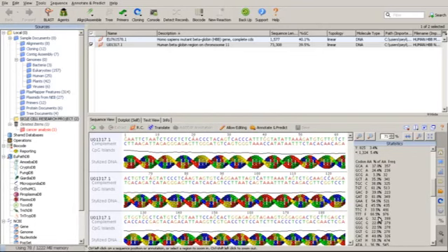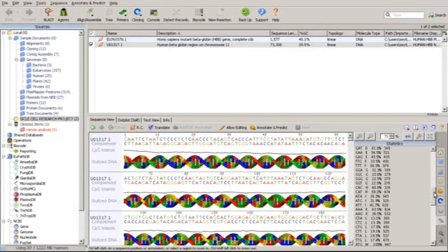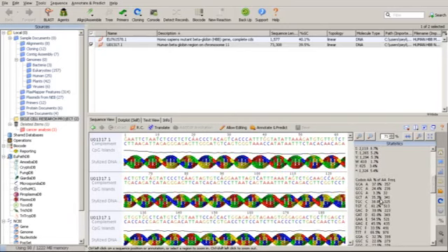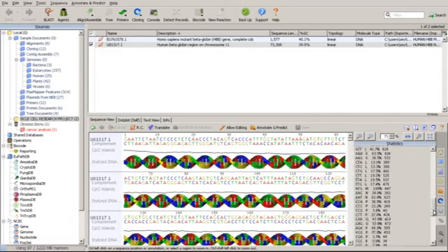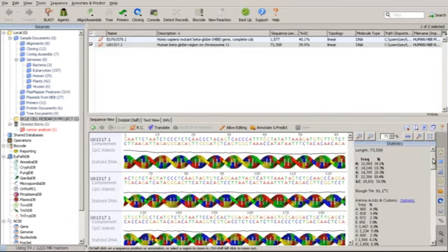The same thing applies to all codons and the amino acids they code for, the percentage, and the number of times, or frequency, they exist in the nucleotide sequence. So I think that's the last part of this aspect.